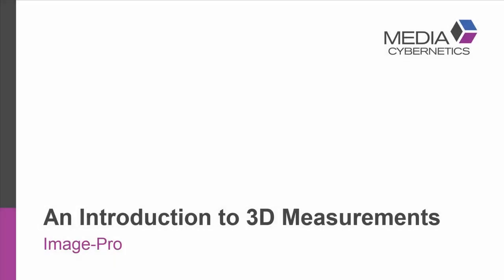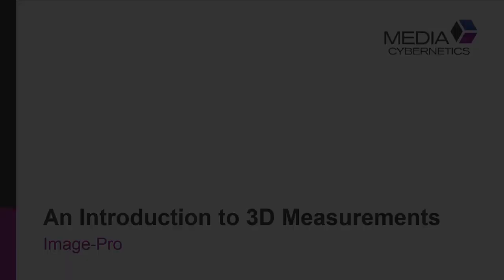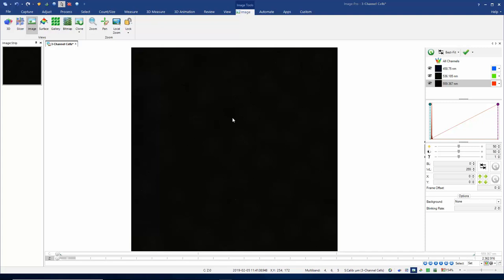Hello, this video is going to be an introduction to 3D measurements in Image Pro. So here I have a nice 3D volume loaded into Image Pro.